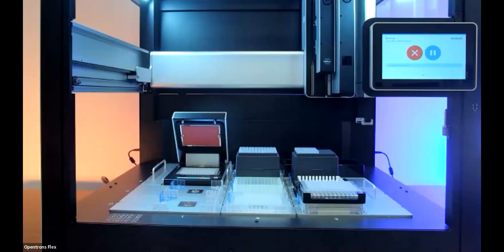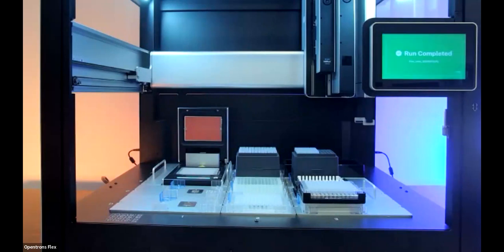In the case of the demo that you saw, we sent the protocol from the run app that was on this laptop to the Flex to be run via Wi-Fi. So you can send protocols via Wi-Fi, you can send protocols via a dedicated USB connection, which is greatly improved from the OT2, and you can also send via Ethernet cable. So there are a lot of options for sending protocols over and generally communicating with the device.